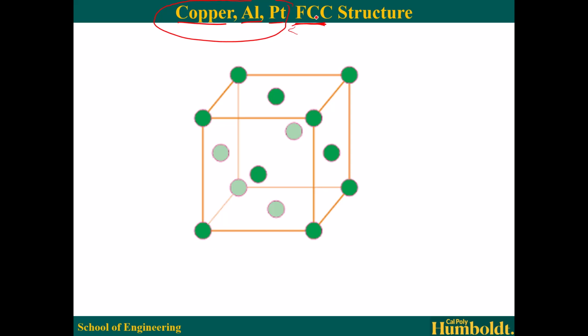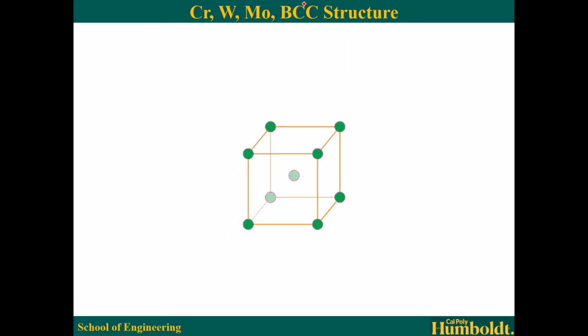But one of the key things is seeing in the XRD plot the HKL indices that the peaks represent and where they occur. We are going to derive selection rules. There are selection rules specific for FCC structures, and we are going to derive those rules and see if those HKL indices appear on our plots. So that's going to be one of our key characteristics.